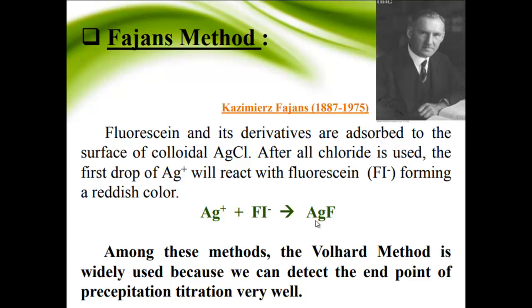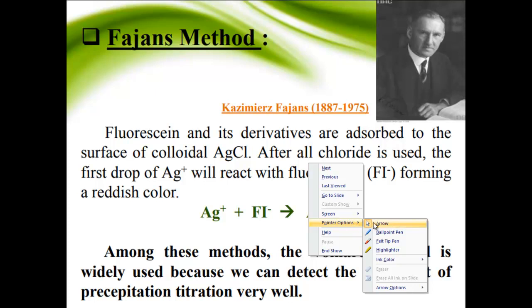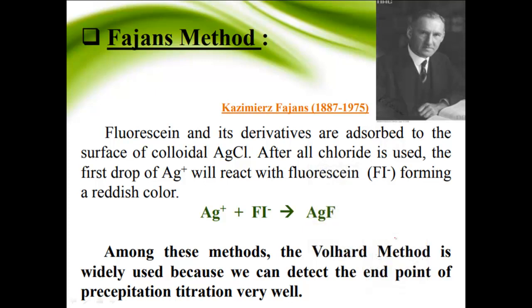When a chloride solution is treated with a solution of silver nitrate, the precipitated silver chloride adsorbs chloride ion. This is called the primary adsorbed layer. It will hold secondarily adsorbed oppositely charged ions present in solution. As soon as the end point is reached, silver ions are present which are now primarily adsorbed, and nitrate ions will be held by secondary adsorption.